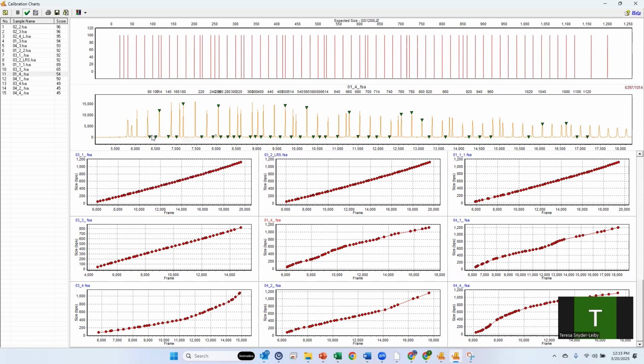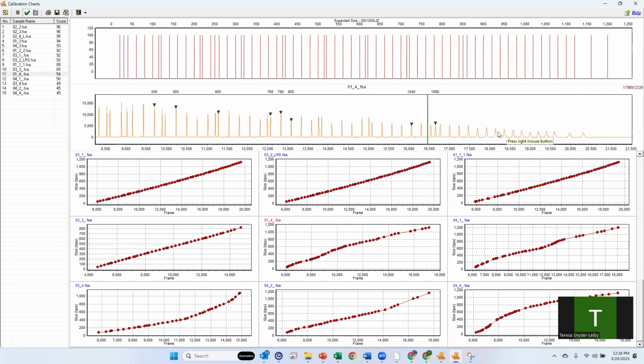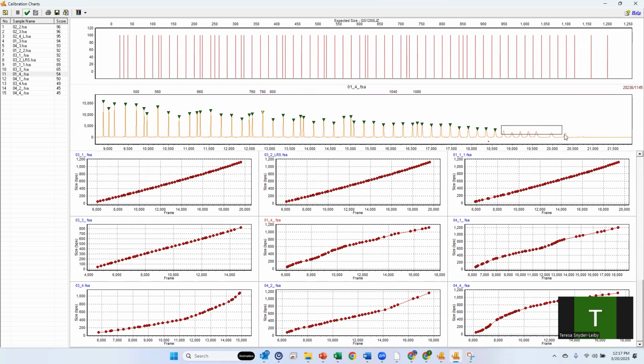And so we need to go through and delete each of these. The software does require that you do this manually. It doesn't want to take things out that you're not planning on taking out. So I'm just going to take a moment and delete each of these. Okay, now that each of those baseline peaks have been removed, I'm going to follow the same process with the Shift key and the left mouse key to add these peaks. Out to the last 2 there.